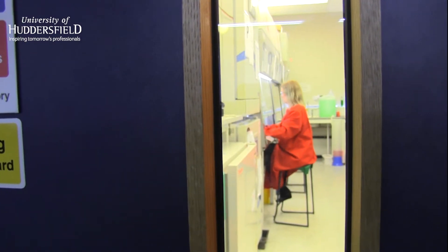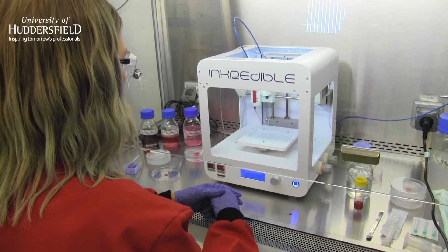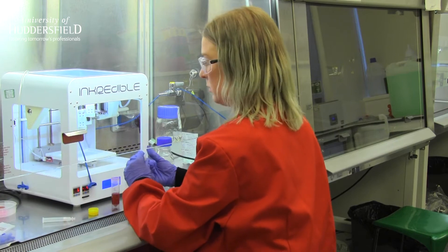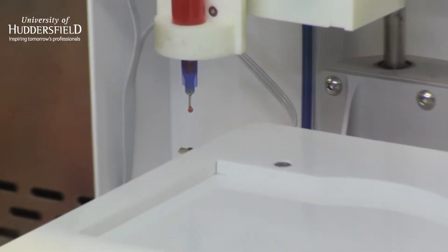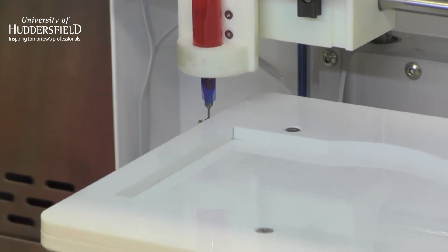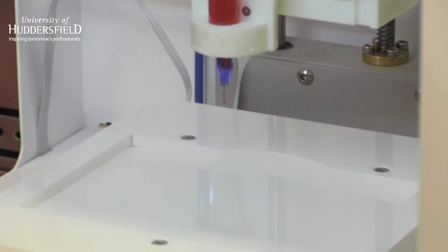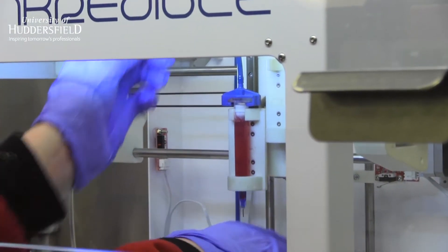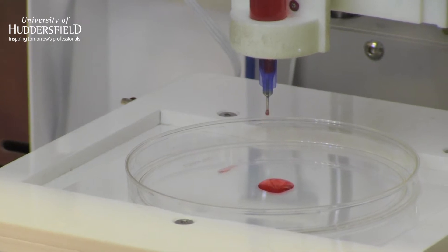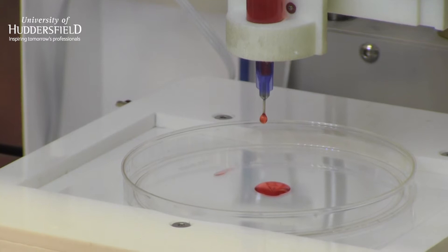The use of 3D bioprinters to produce replacement human tissue is one of the most exciting developments in medical science. Human tissues are integrated with both soft and stiff material, for example cartilage and bone. However, due to the lack of compatibility of soft materials for the bioprinting process, printing softer tissue layers has been a problem for scientists until now.